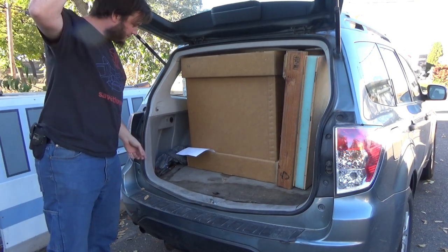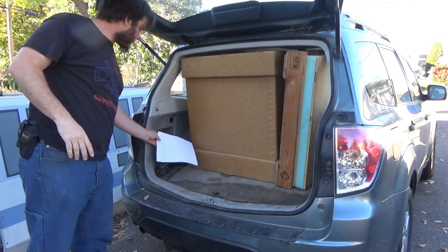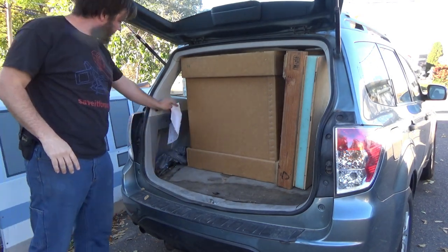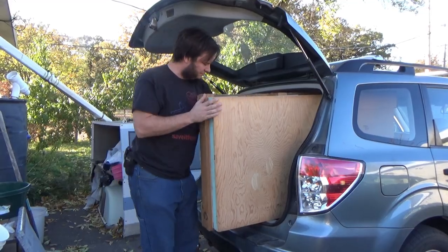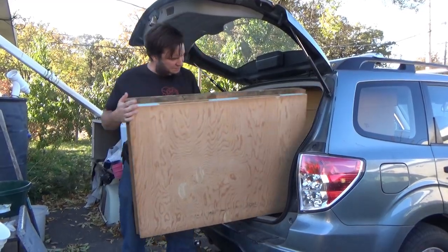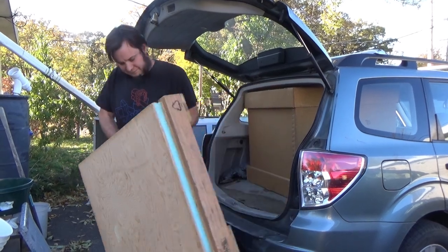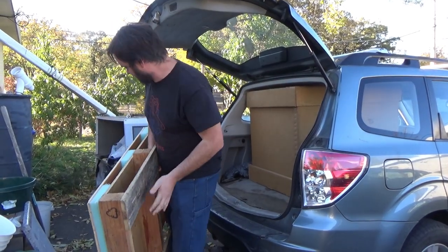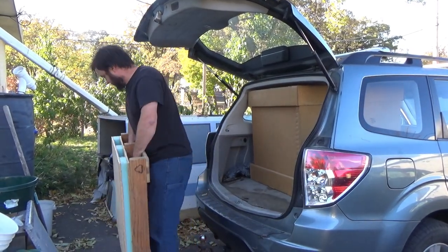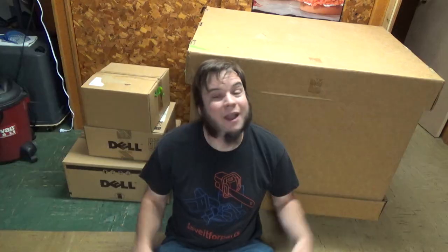This thing appears to be new in the box, or in this case, on the pallet. It was a little bit bigger than I expected it to be and I didn't know if it would fit in the car, but somehow we got this thing home from the auction company. Okay, so what do I actually have? What's in here? What does a DNA sequencer look like? Let's do a little unboxing and find out.